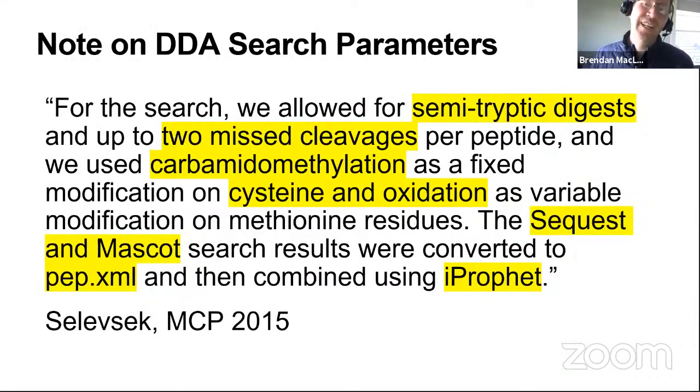So I sat down, read the manuscripts, downloaded all the data, and then created these instructional data sets that we're working on here. This is the second one, but I wanted to highlight some things in the manuscript that were important to me.